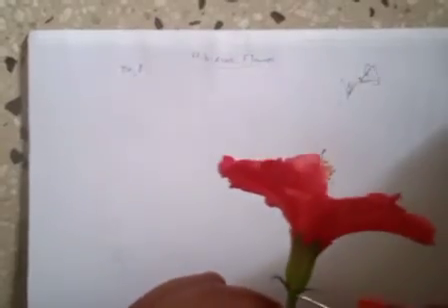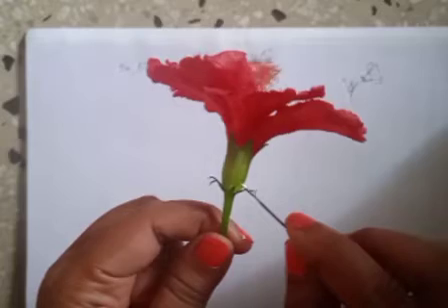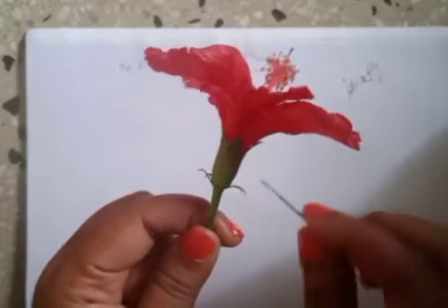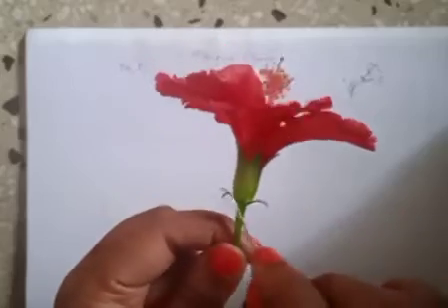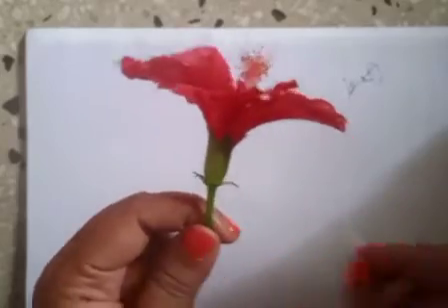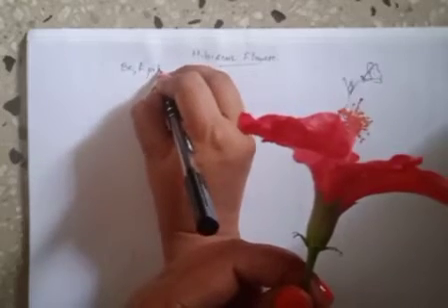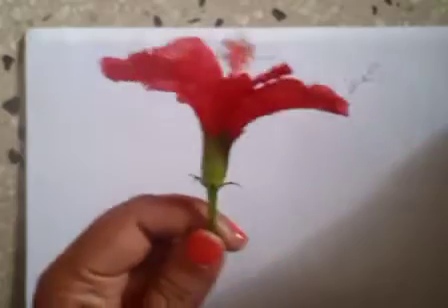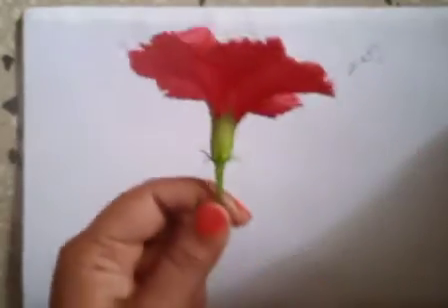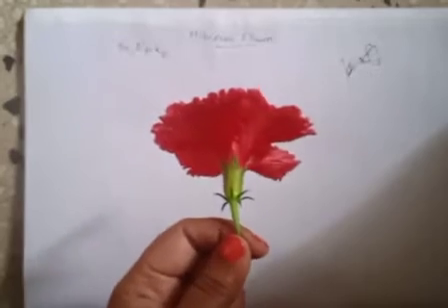If I count, 1, 2, 3, 4, 5, 6. So there are 6 epicalyx. So I can put epic 6. So I have put epic 6.